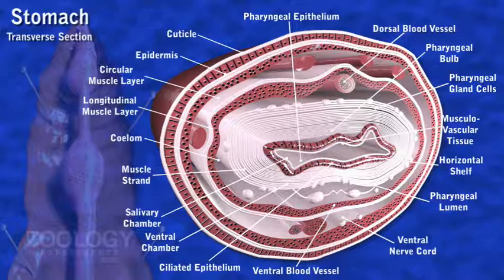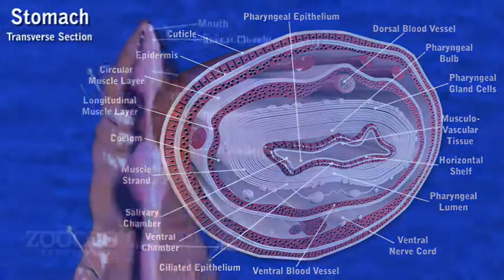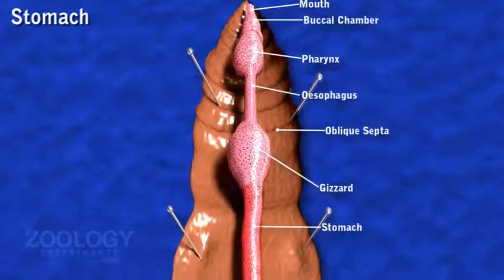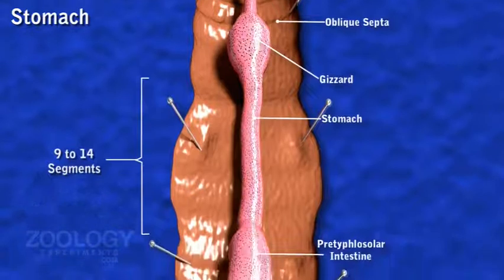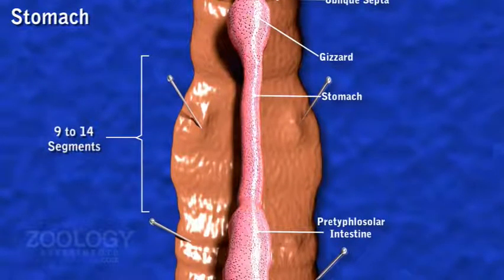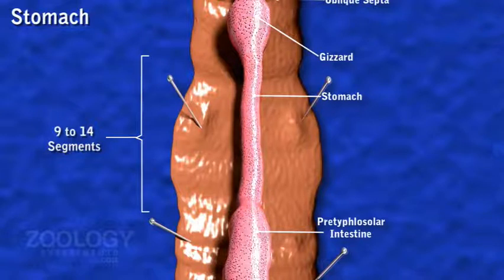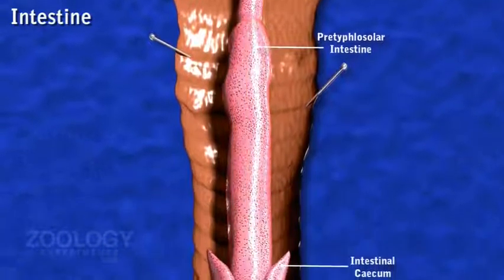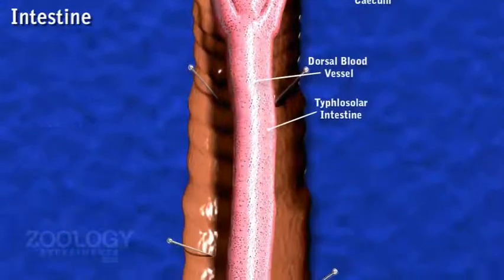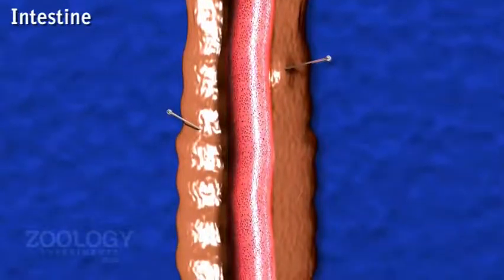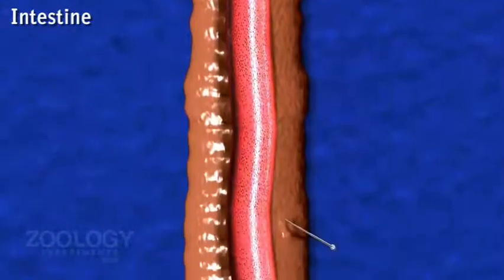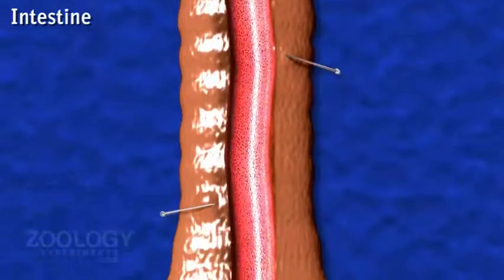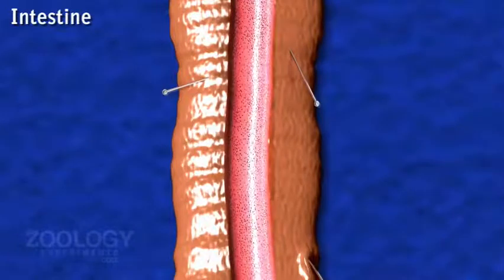The gizzard is followed by a short, narrow tube, the stomach, which extends from the 9th to the 14th segment, with a sphincter at each end. Its walls are highly vascular and glandular and thrown into internal transverse folds. The intestine is next to the stomach, which is a long, wide and thin-walled tube extending from the 15th segment to the last. It has a beaded appearance due to circular constrictions corresponding to septa.